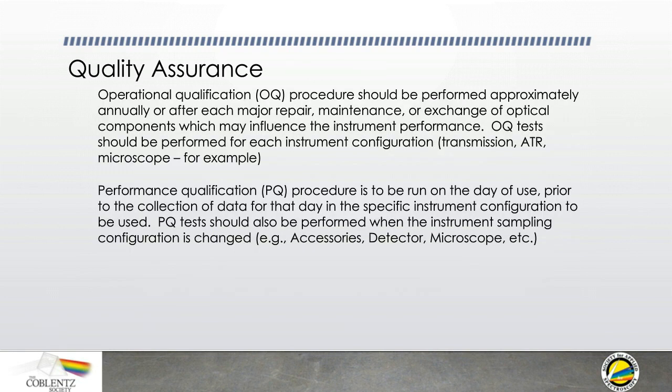So, I've discussed a little bit about the two things that you should look for to start out with how your instrument is working. And all of this comes into the quality control, quality assurance that you want to be doing with your instrument.